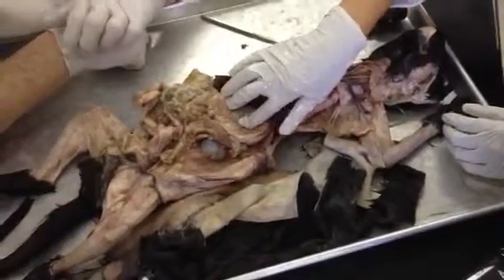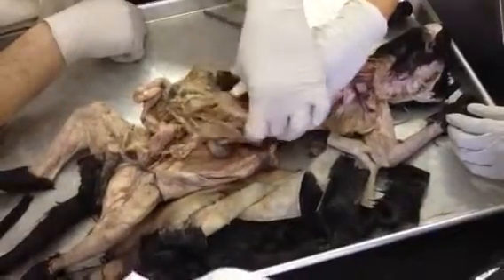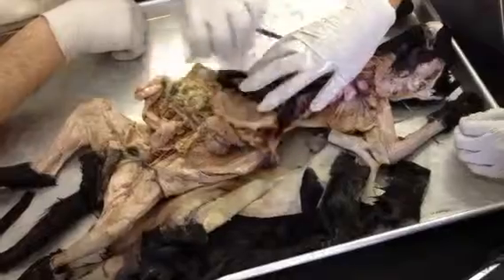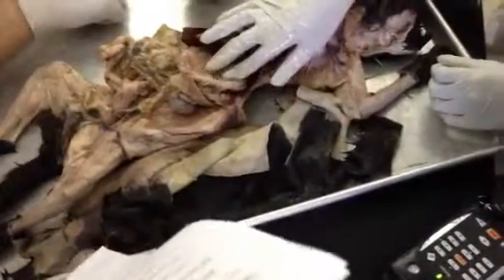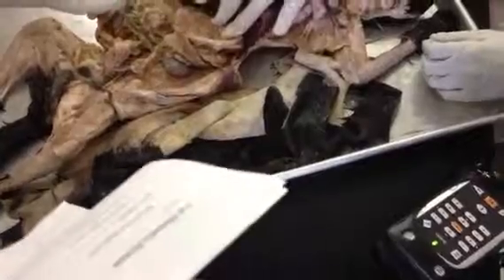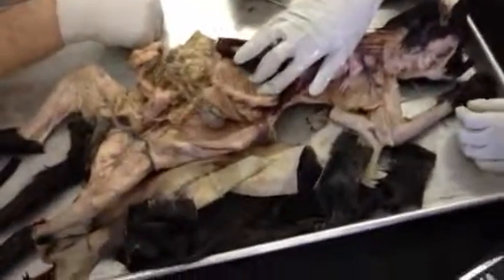Are you going to ask us about the rugae? This stomach hasn't been opened up, and I haven't seen too many that are. What I can do is open this stomach. Let me go get a scalpel. I'm going to do a frontal section on this stomach. We'll open it and we'll see if there are rugae in there. If the stomach's empty, usually the inner wall is shrunken up and folded up into ridges. Those are the rugae. I'll be right back.